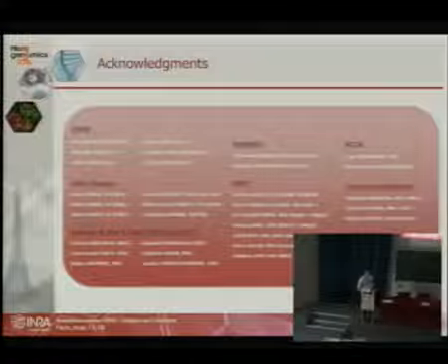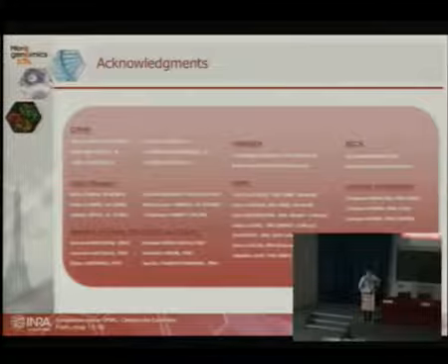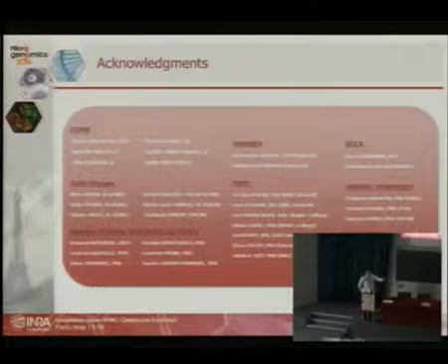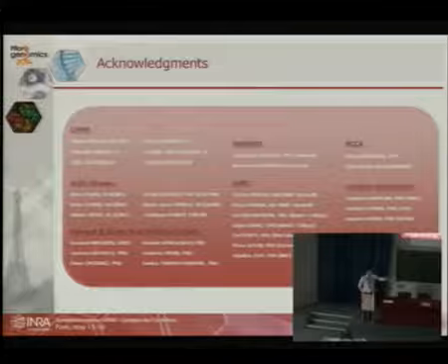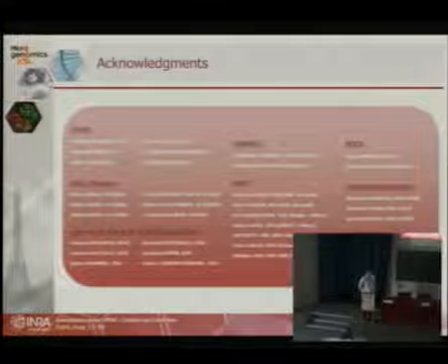I would say it depends on the instrument, because at the moment we cannot do more than 18 fluorescents. New instruments are coming up. At a cytometry conference, someone said he made 26. So the machine is in the pipe, and it will relieve this. But for the moment, 15 is achievable with work, and in many cases people can do 13 without very big issues.